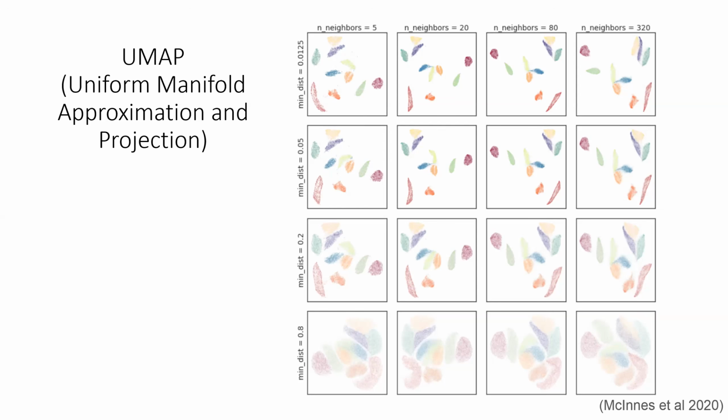So some issues with doing this in 20,000 dimensions is because there are so many variables, it's such high dimension, distances between similar cells and different cells become smaller. So people often reduce the dimensionality of the data to only include the most highly variable directions so that the distances between different cells become bigger.